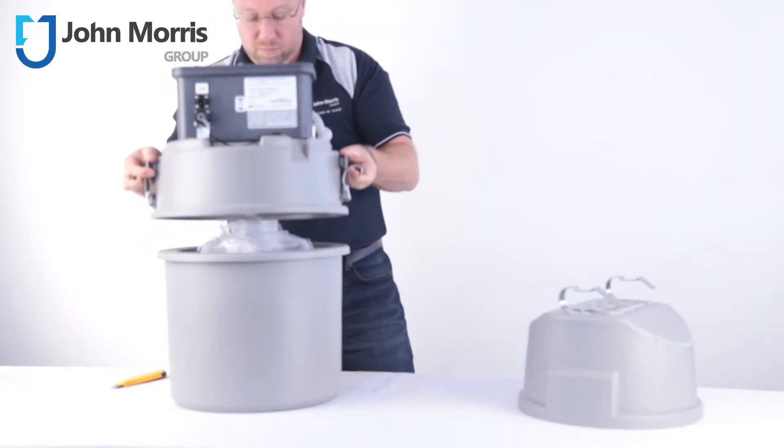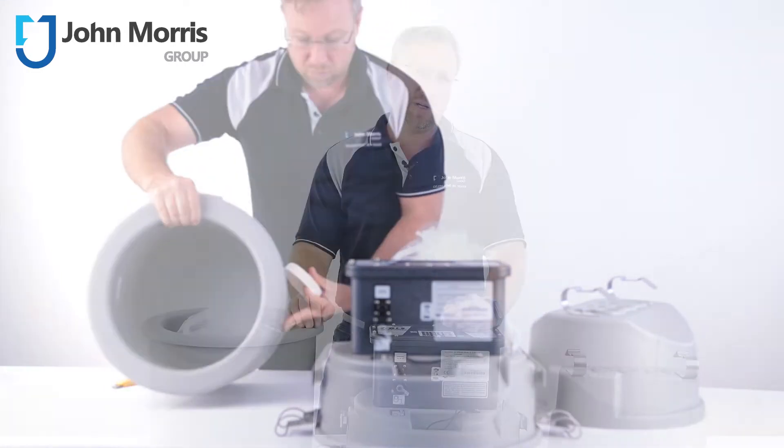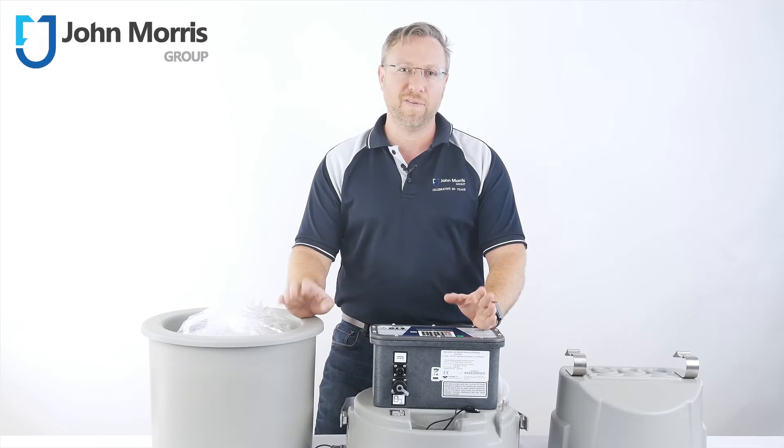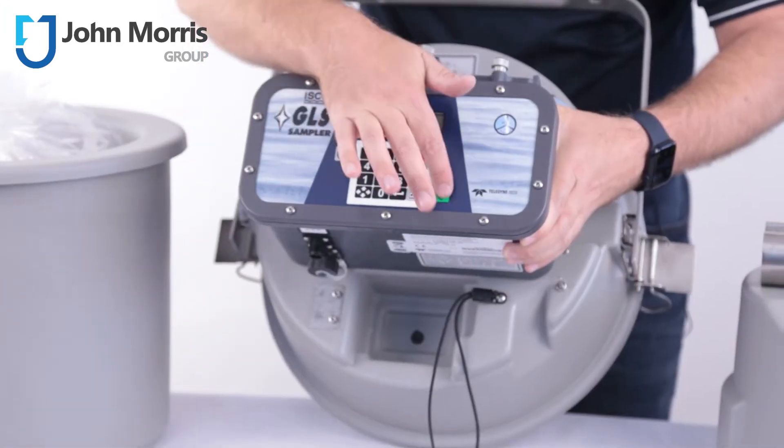In a world where everything is going Wi-Fi, Bluetooth, IoT and connected devices, the ISCO GLS maintains a rugged, tested platform that does what it says on the tin with a minimum of fuss. Just two keystrokes and you can recall and activate your program and be on your way.